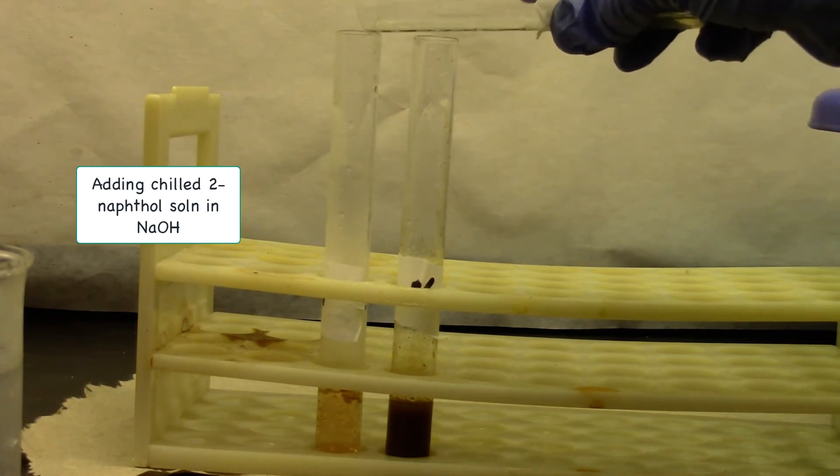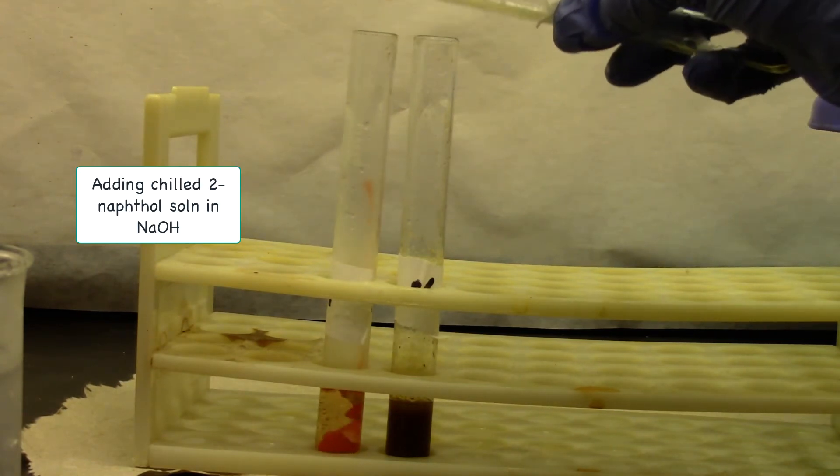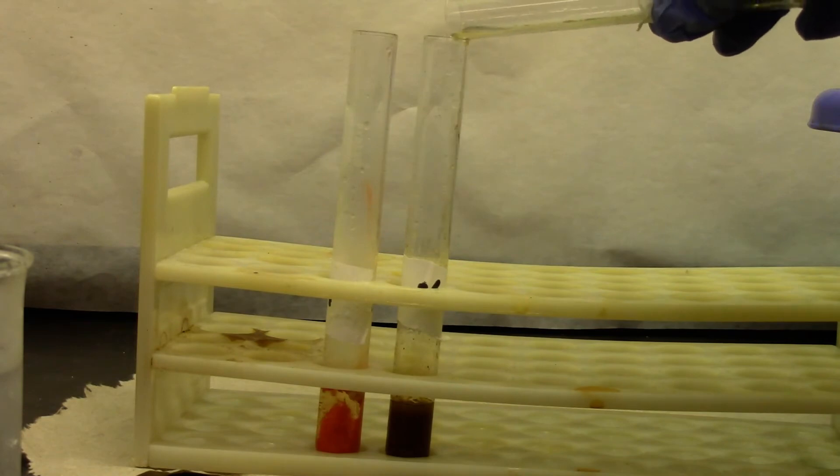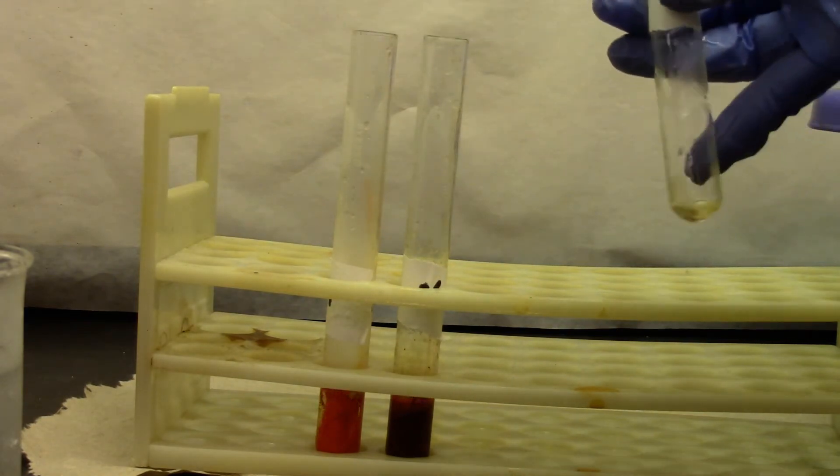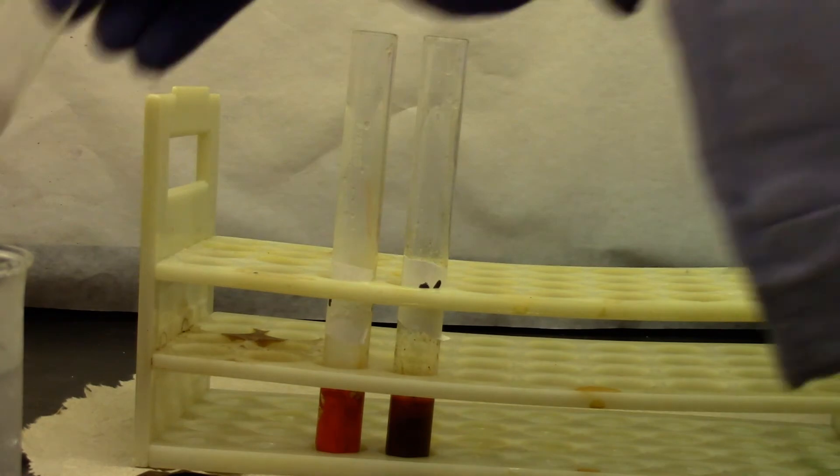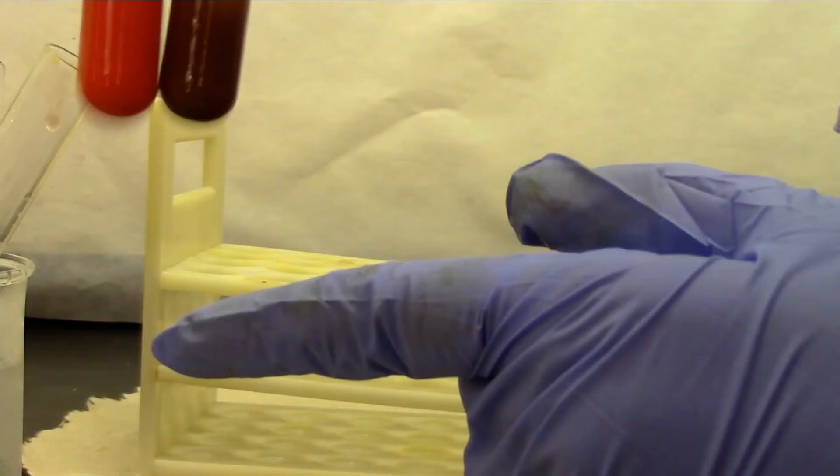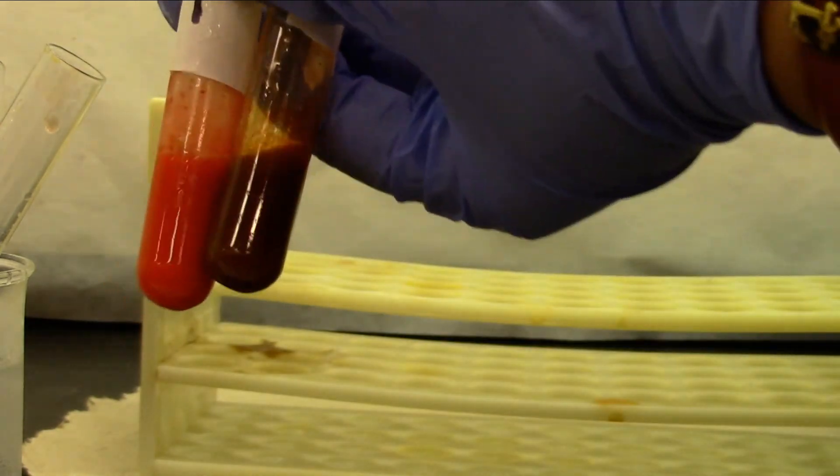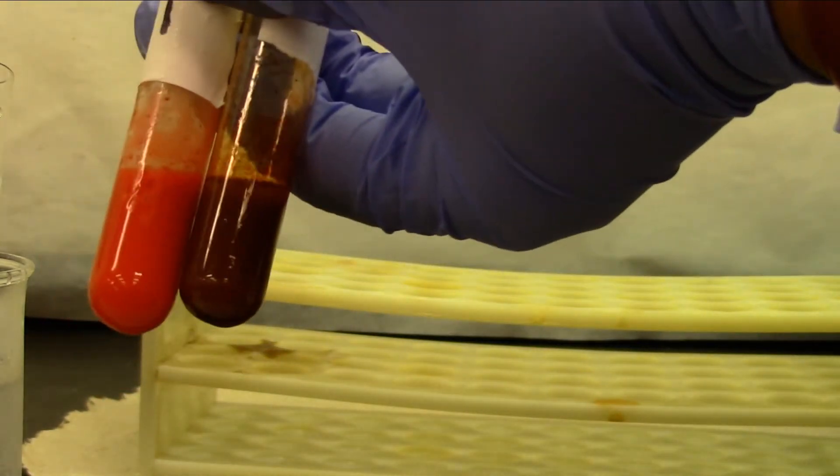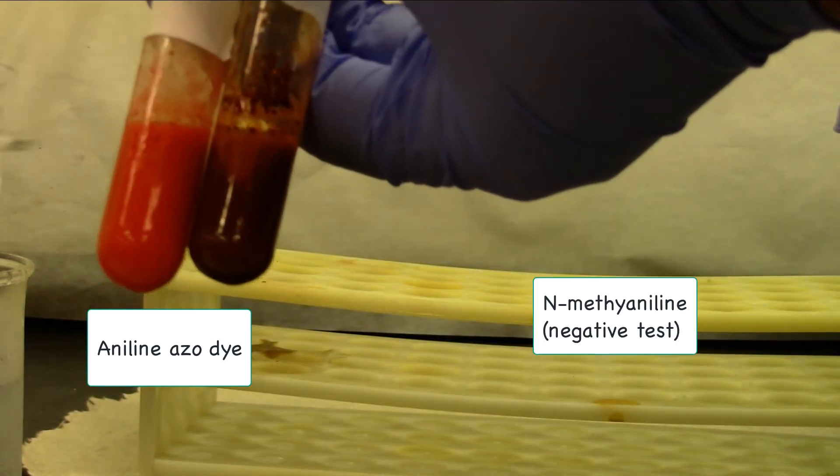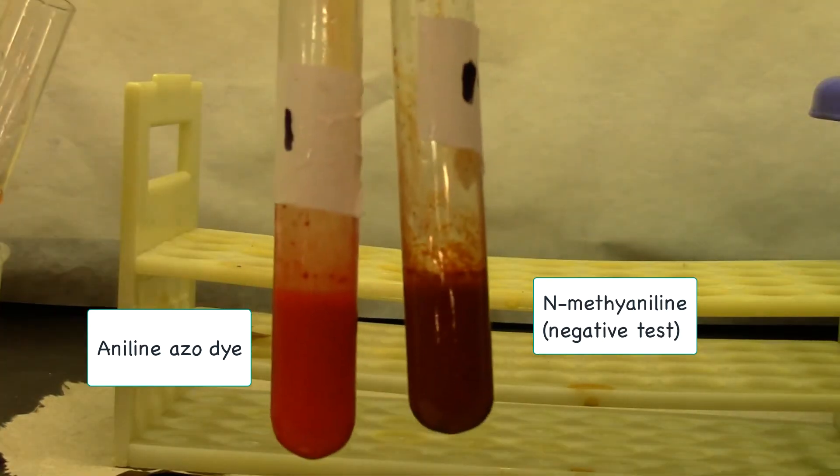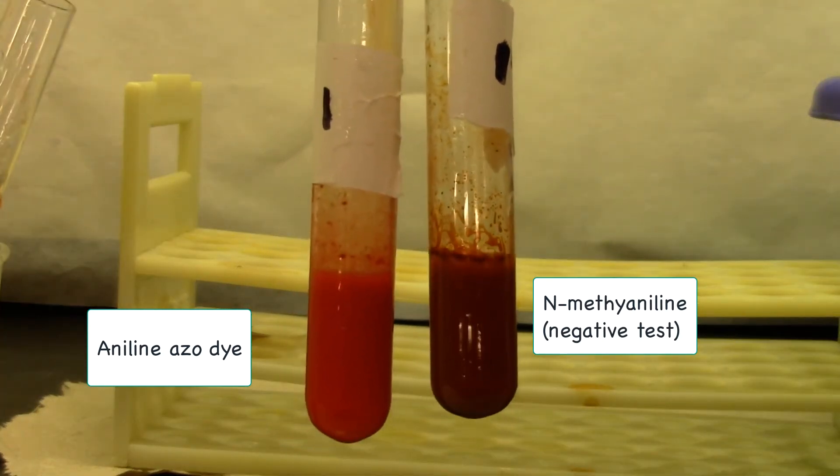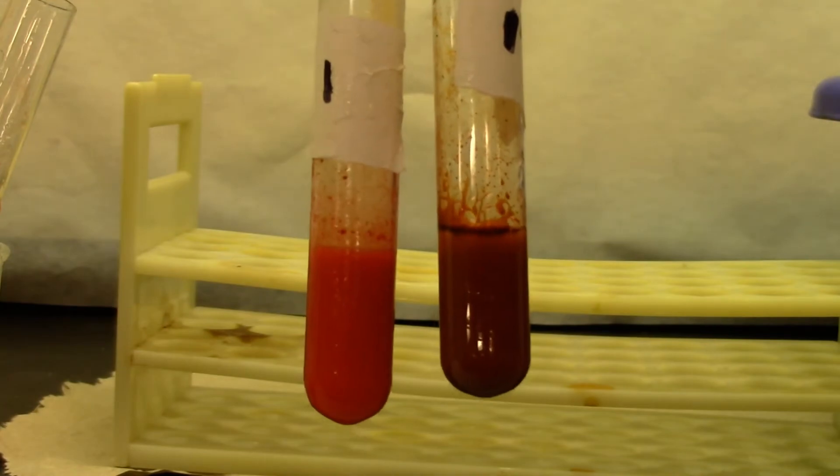When I add it to the aniline diazonium salt, it will produce a red-orange dye. Give it a mix. A secondary aromatic amine for our negative test produces a coloration, but not a red-orange dye. The primary amine is red-orange. This is more like a dark red.